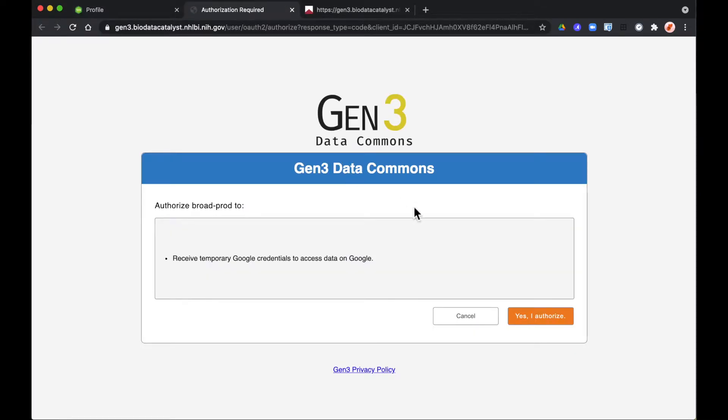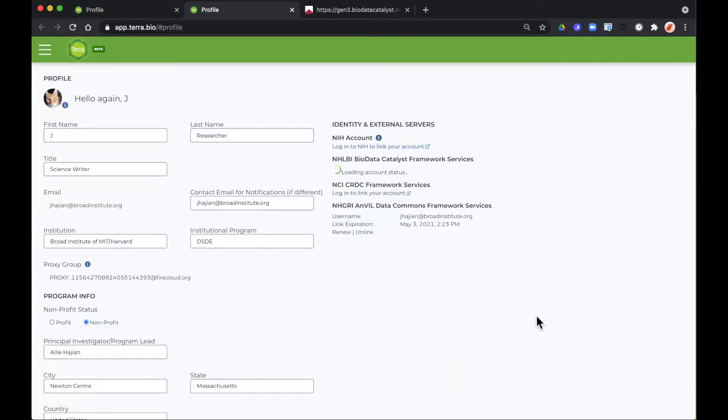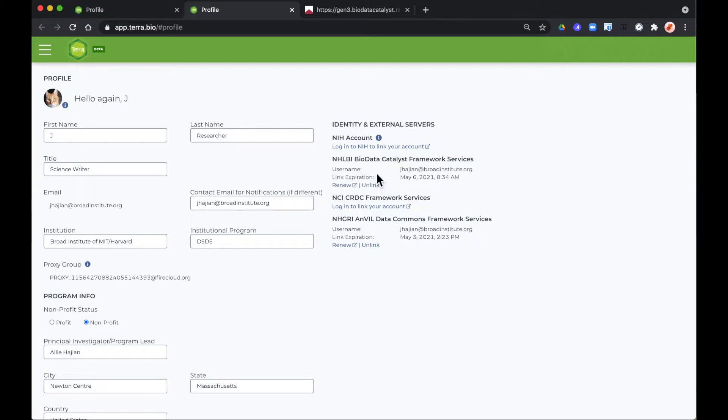You'll be redirected to the login page. Terra will recognize whatever mechanism you use to log into Gen3. You'll see you have a link expiration date right here. Remember links expire after 15 days.